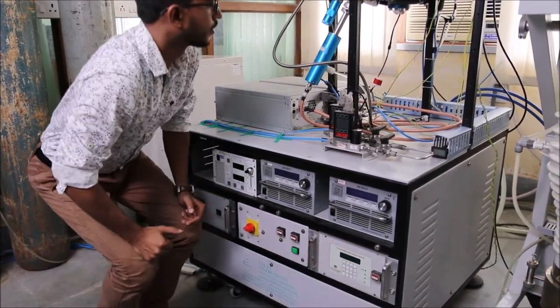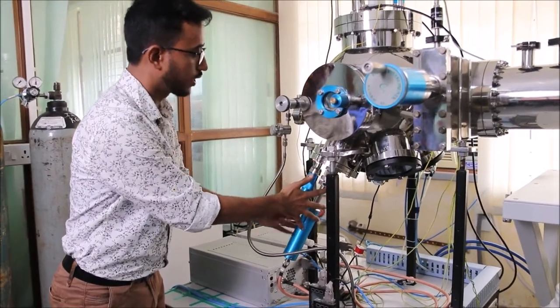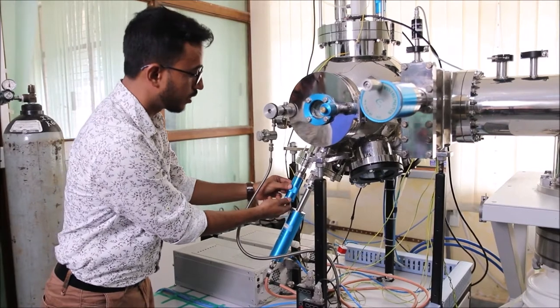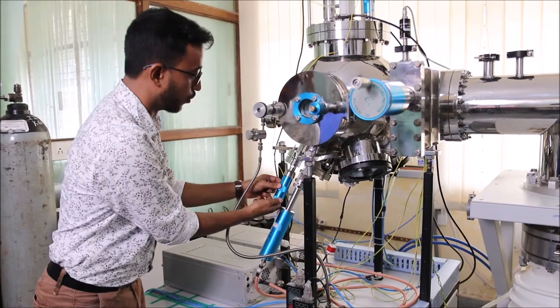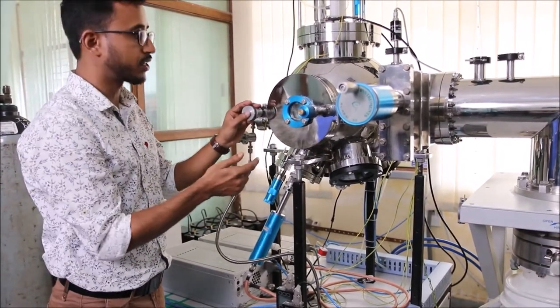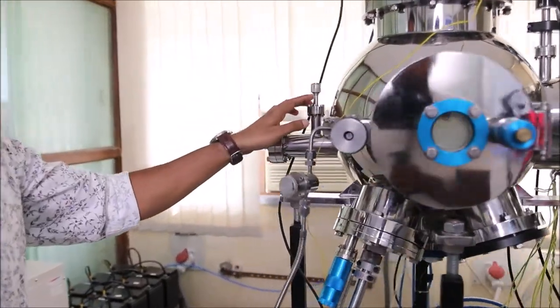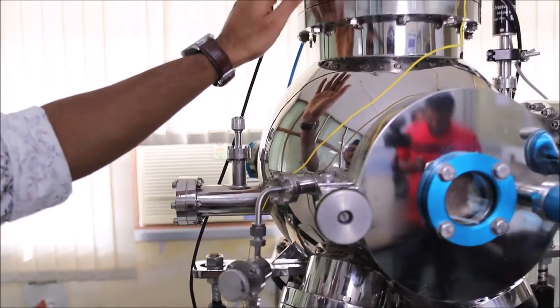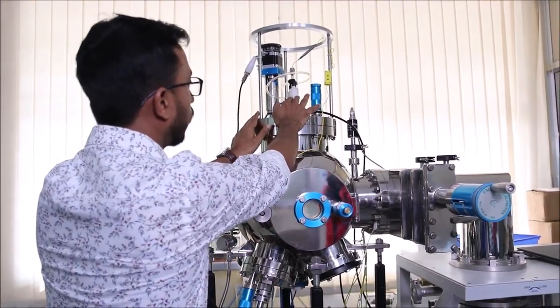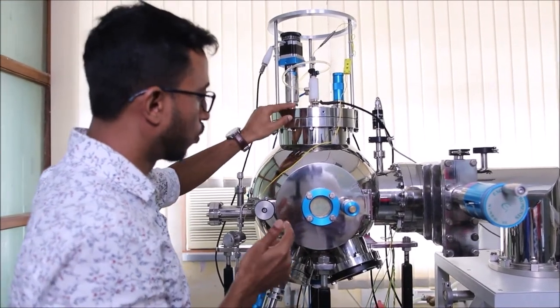At the top is the main chamber unit. This part is called a gun, where the target is connected — the material we want to deposit — through these power cables. This is the shutter where we close the target output of the plasma coming out from the target. This is the door where we load our substrate into the chamber. This is a venting needle valve for venting from atmospheric air. On top, there is a motor to rotate the substrate, along with two water lines for regulating temperature around the substrate.